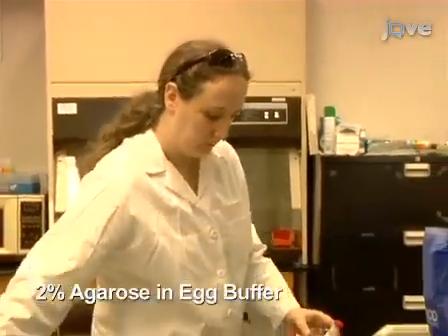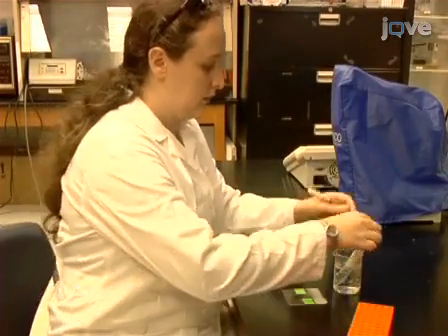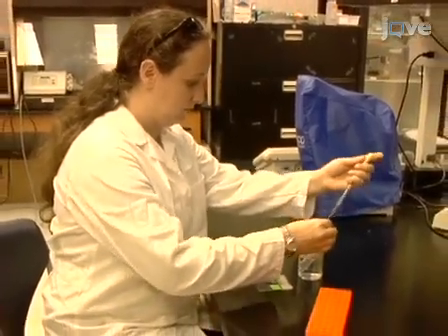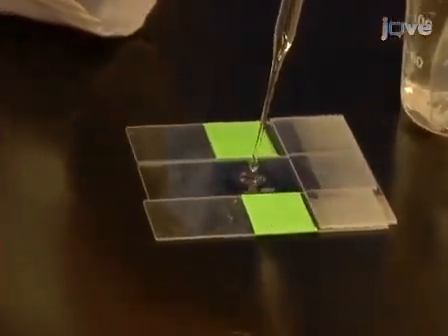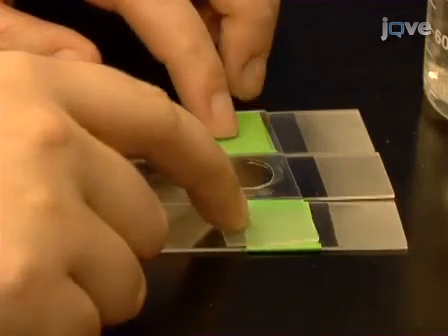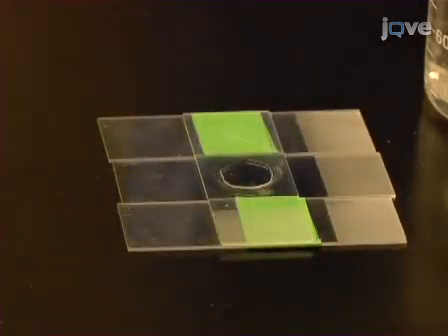Begin by preparing a new agarose pad for viewing the injected embryos. With the Pasteur pipette, put 3 drops of molten agarose onto a clean microscope slide and place that slide between 2 other slides wrapped in 1 layer of labeling tape. The tape controls the thickness of the pad. Next, press the clean microscope slide down onto the agarose drops so it rests on the taped slides. Do not remove the top slide until the embryos are ready to mount.